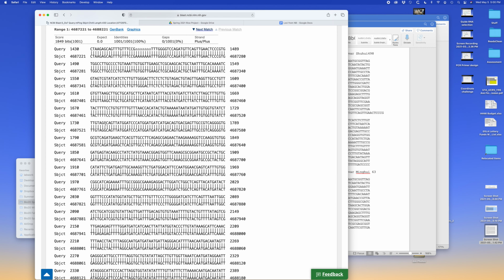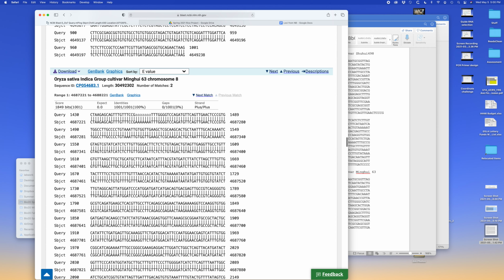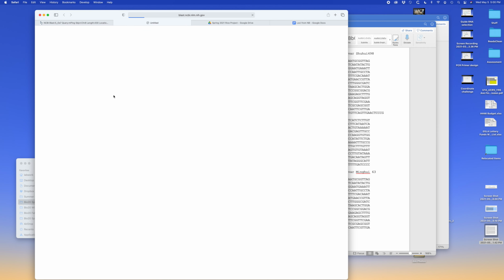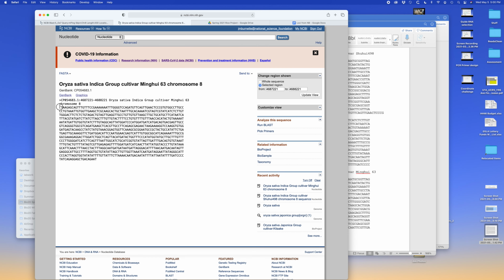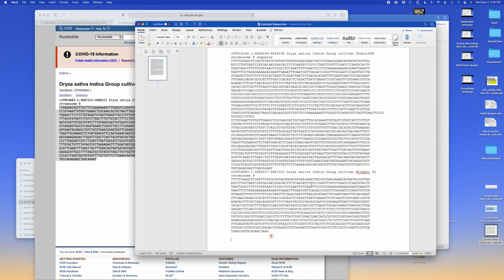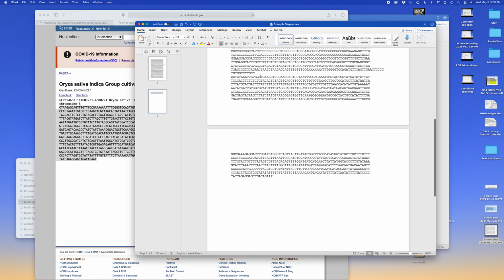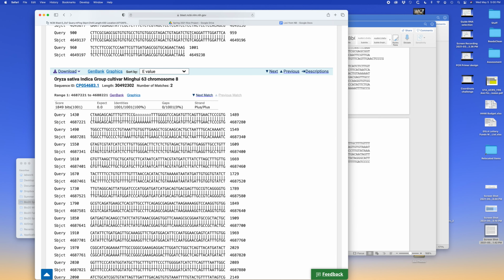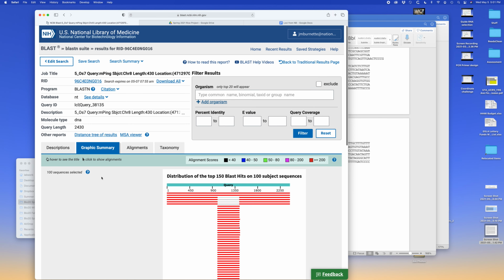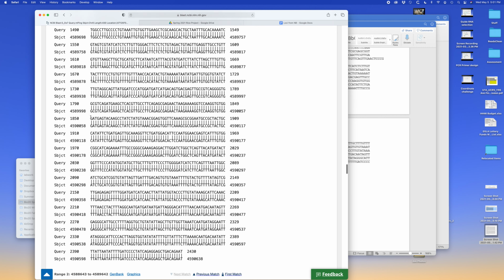You can see, quite surprisingly, I think, there's very little difference between the indica and the japonicas here. That's going to be kind of interesting. We'll get the last bit of our sequence here and paste it there. It doesn't matter that it doesn't look very pretty. We're not going to bother cleaning that up. So that's the second one. Let me do it 2 more times quickly.